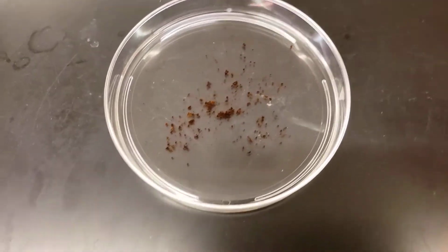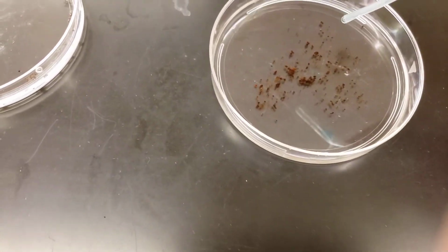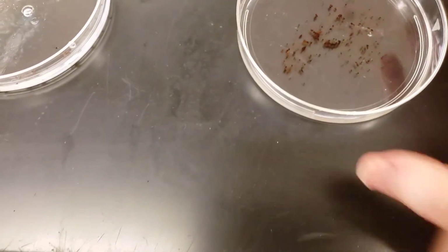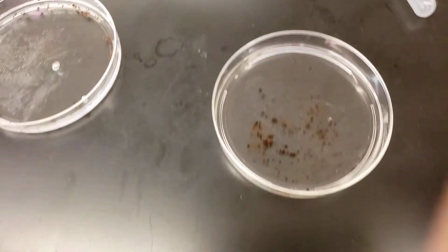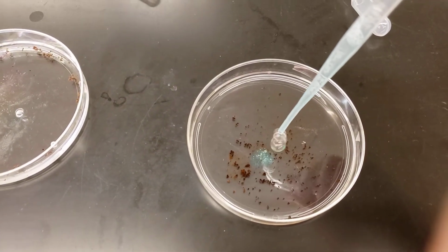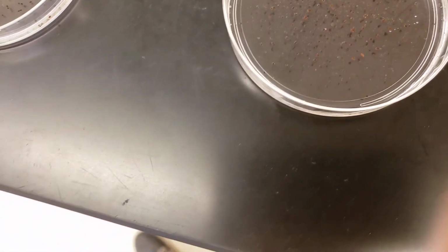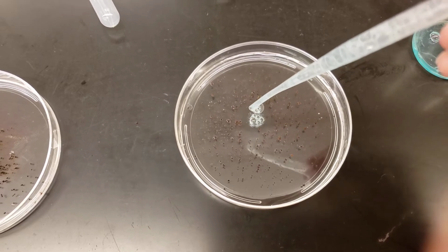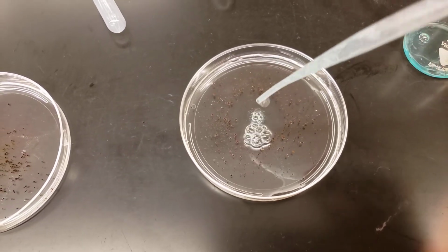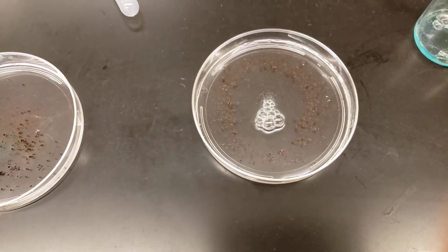Now we're going to go over to our alcohol. And we can see that nothing moved because the surface tension was already broken. Our flakes already sunk down to the bottom. So when we add soap to them, they don't move because our surface tension is so low, it's already been broken. And last but not least, we have our glycerin, where when we add soap to that one, we can see that things move out of the way, but they move a lot slower than we saw move with the water.